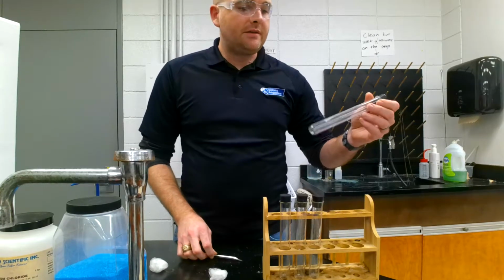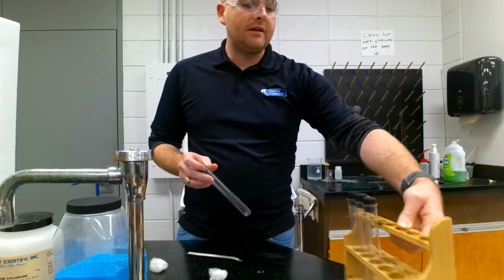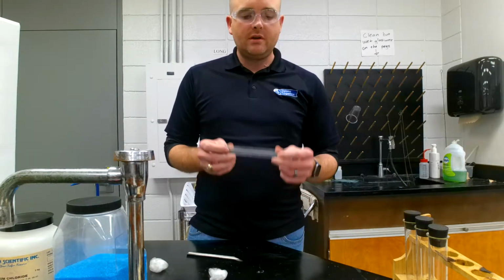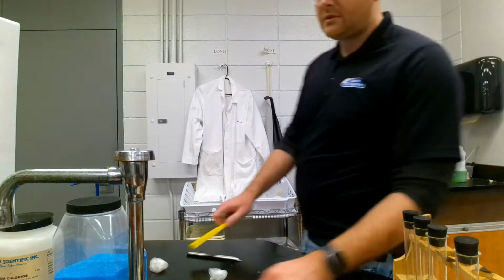Today we're going to try to investigate and see what a redox reaction might actually look like. Now we did a little bit of reading about rust before, so we're going to see if we can simulate that. Now first, I'm going to need my nails.